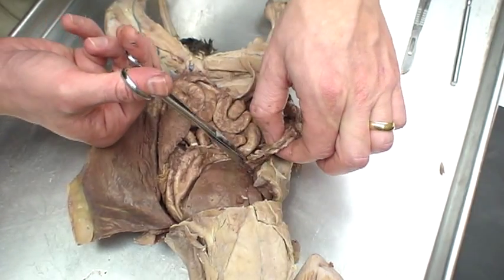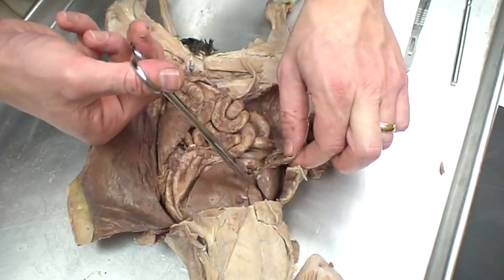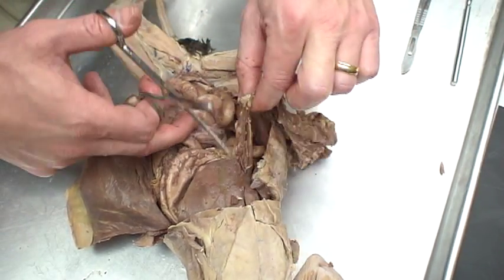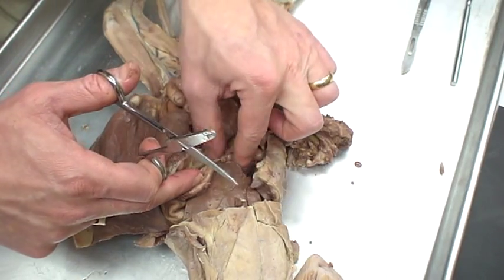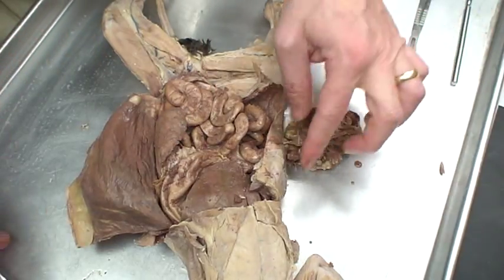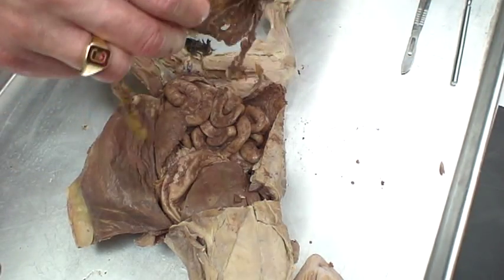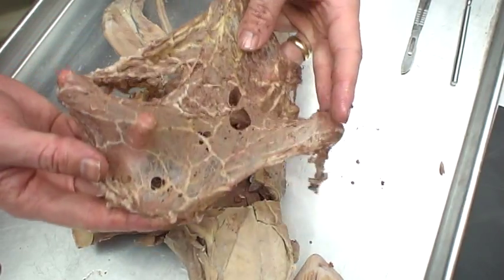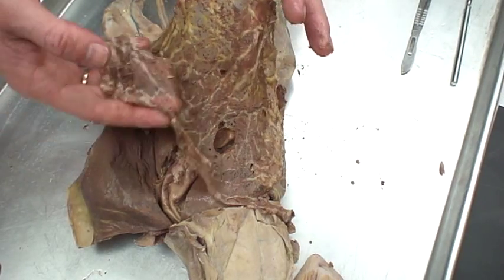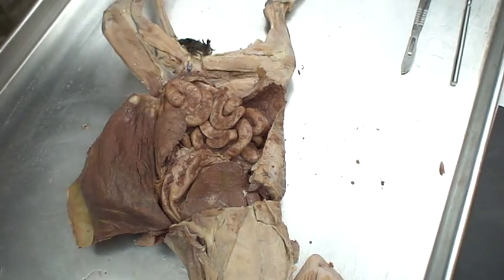All I'm doing is separating this greater omentum from the rest of the digestive system so you can see the small intestines and everything else inside. It comes off in one big sheet. You want to be careful as you're doing this because it also ties to the pancreas and other organs — I'll clean that up more later off-camera. Once we do that, we see this is the big sheet of the greater omentum. Most of it is mesentery. It almost feels like saran wrap. I'm not going to seal up any sandwiches or leftovers with this, though.